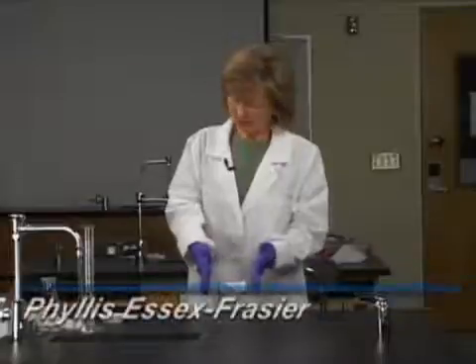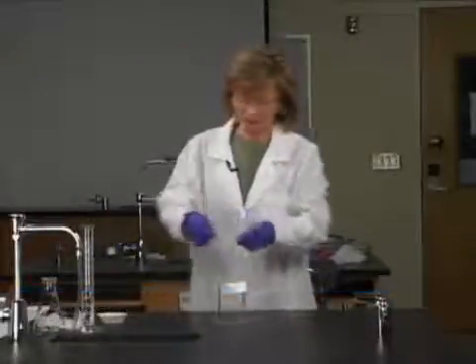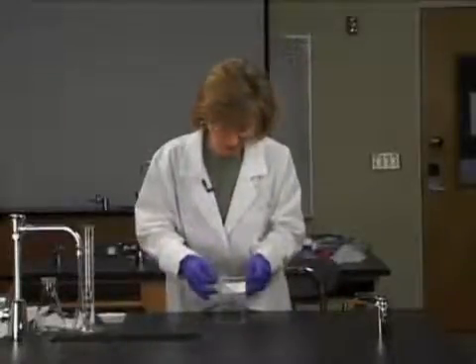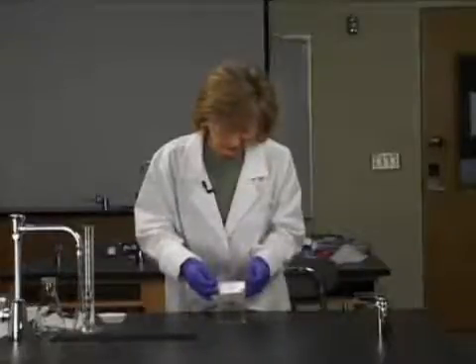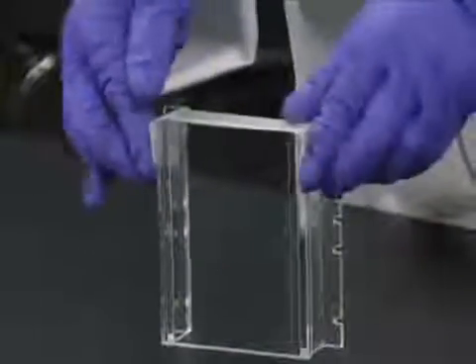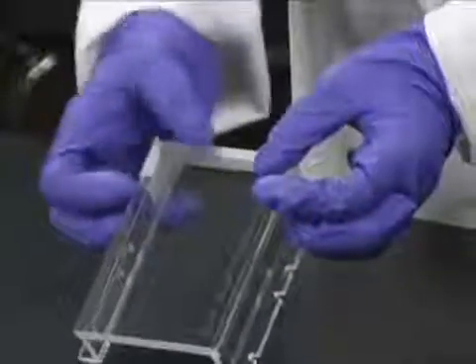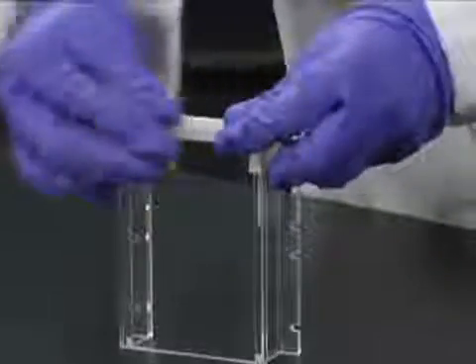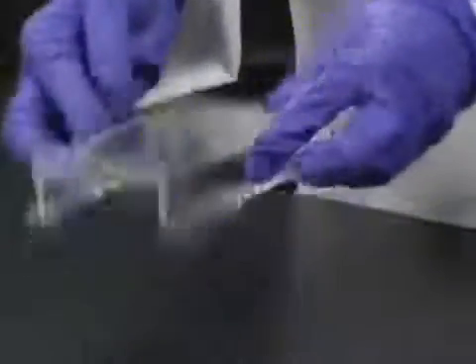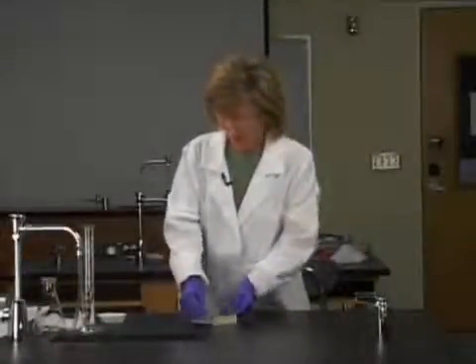I have here this lovely little gel mold, and I'm going to seal the ends of this mold with just regular old masking tape. Mind you, it has been wiped down with ethanol. So we're going to push down just like a Christmas present. We're going to push the ends down to make sure that when we pour our agarose in here, it doesn't leak. And we'll do the same thing to the other end. So that should do it.